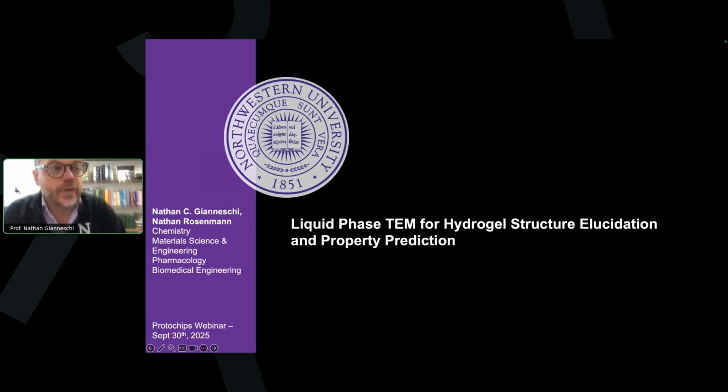And so it stood out to us both in terms of a target structure that would be interesting to look at, what might we learn about the architectures, and then way beyond that, how could we study, for example, particle interactions with gel matrices in real time. And so you can imagine different potential applications, including the basic science of architecture and then, for example, diffusion through such matrices. So those are the types of questions we were asking.